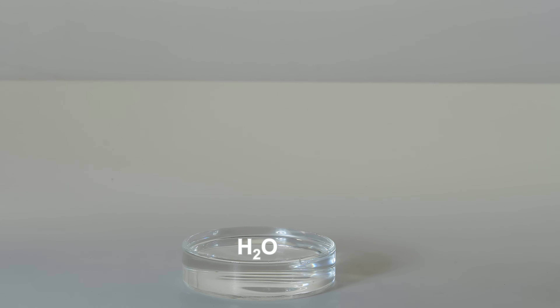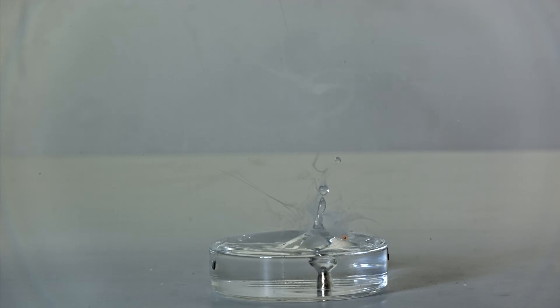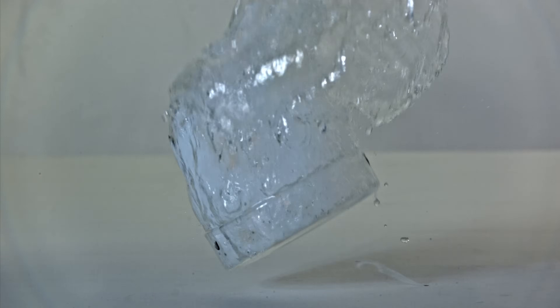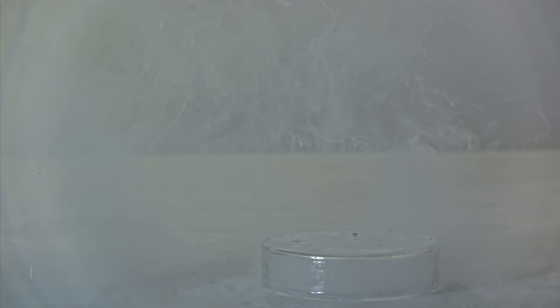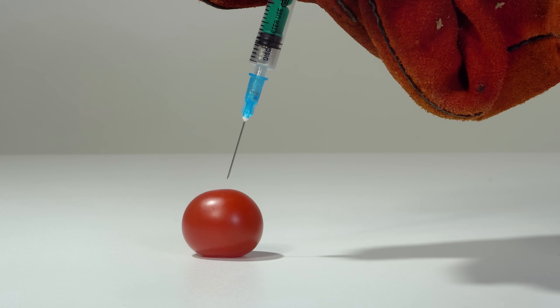The reaction with water was much calmer. I decided to inject this alloy into a tomato.